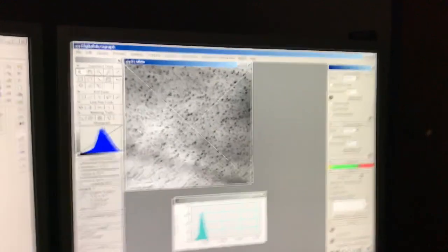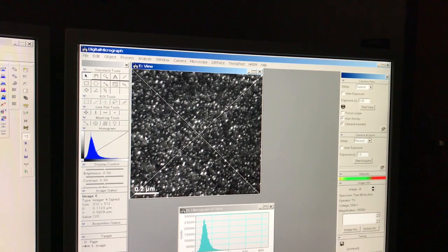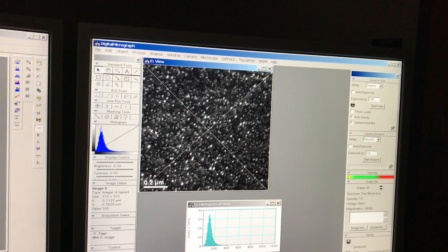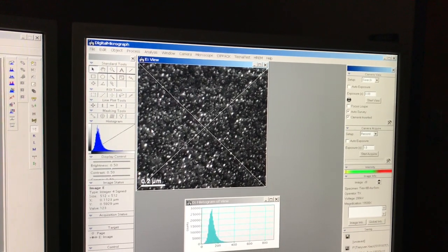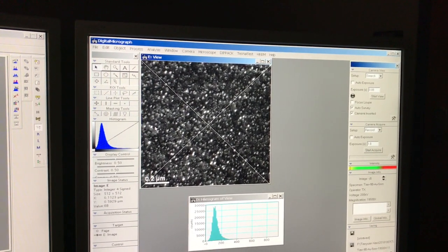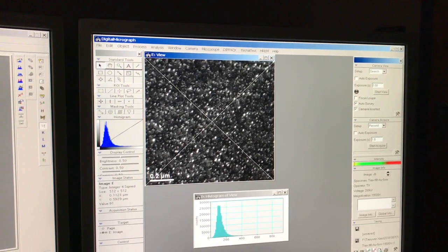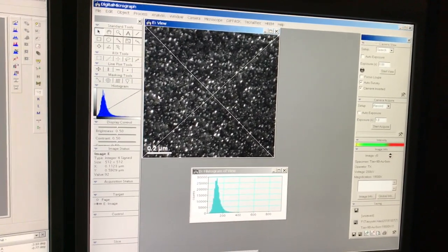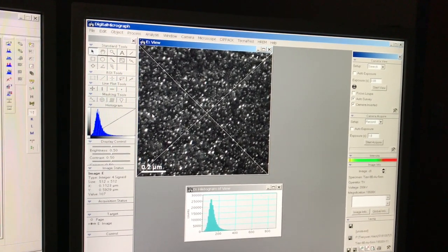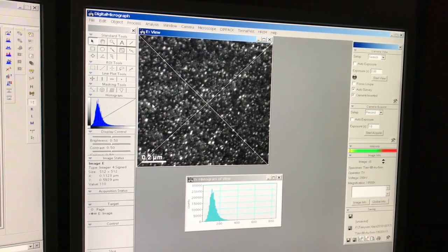So if I now hit the dark field button, now I have the CDF image. The same benefit that we got in bright field by going to positive S, we get in the CDF image, except now my contrast is reversed. My defective regions were dark in the bright field image, now they are light in the dark field image. Usually your focus isn't too different between bright field and dark field, but you can always adjust it a little bit when you get into dark field.